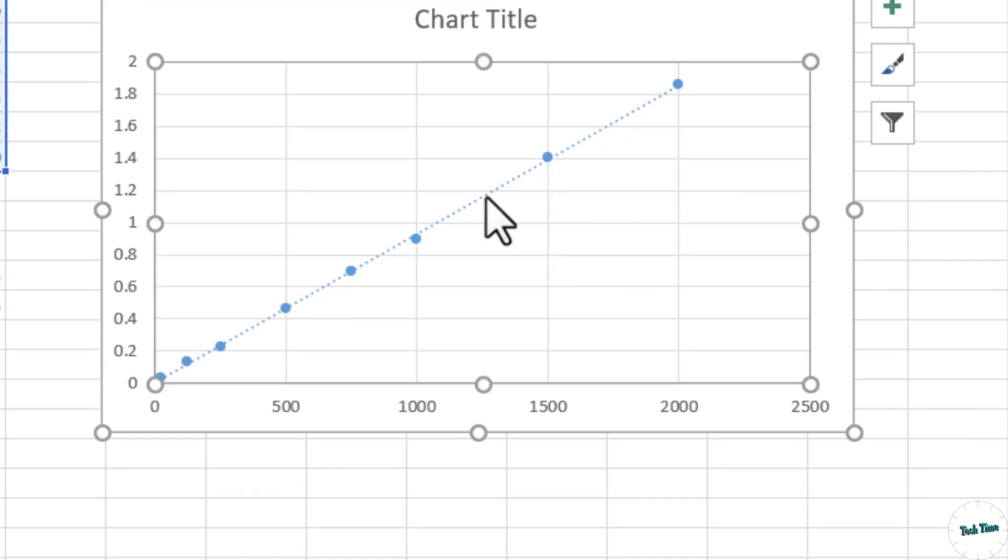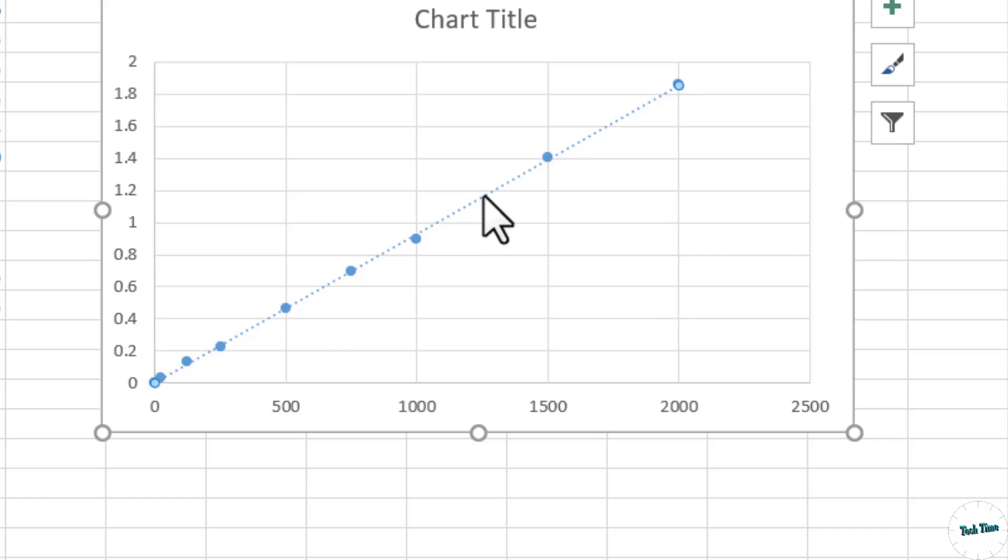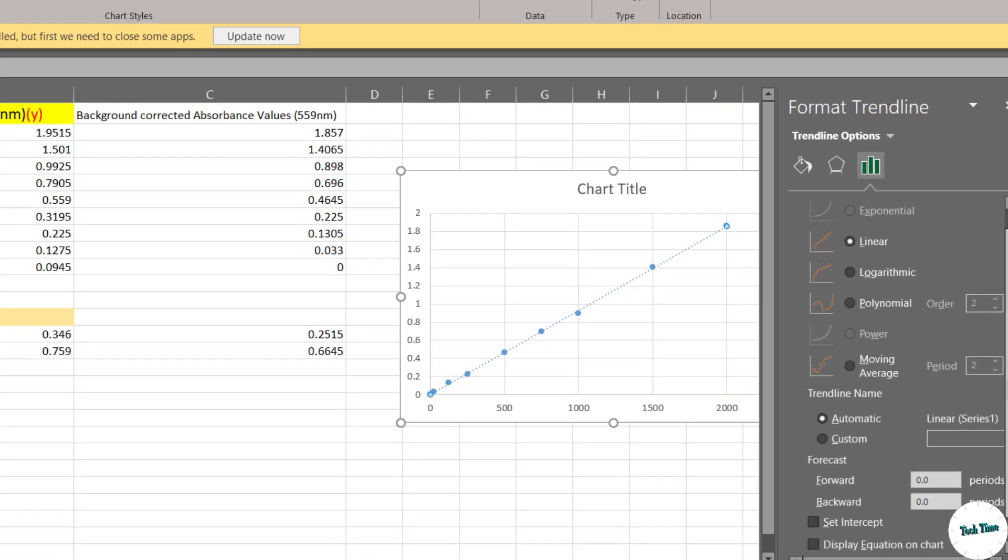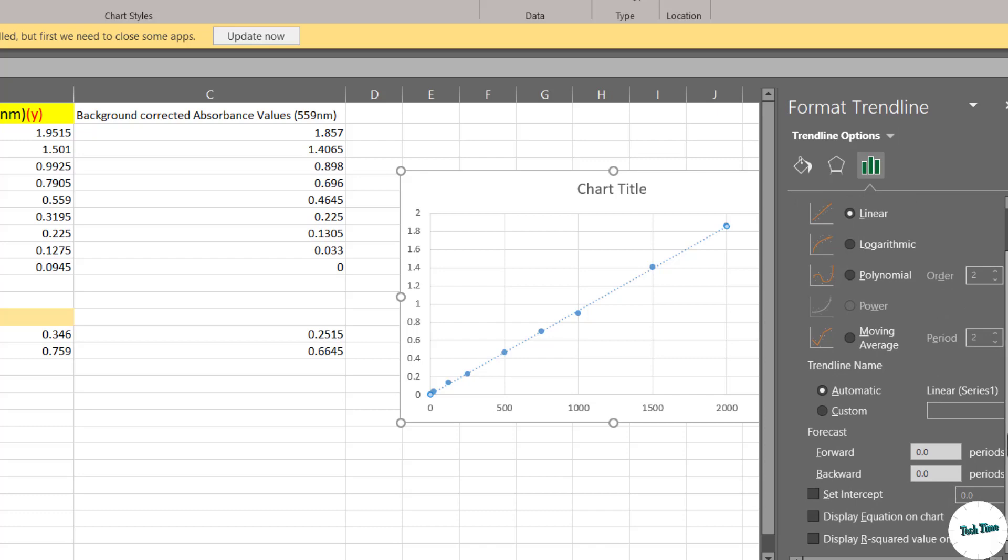Next, you can double click on this trendline and we have format trendline option opened. Scroll down and right at the bottom you can see we have some options like set intercept, display equation on chart and display R squared value on chart.